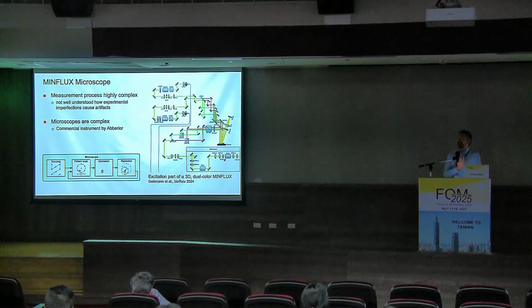So we have these complex instruments, and that's why I think we are very lucky that the Abberior company produced a commercial version of these instruments. They're not very cheap, but they produce quite decent data, and also my group now has one of those instruments.